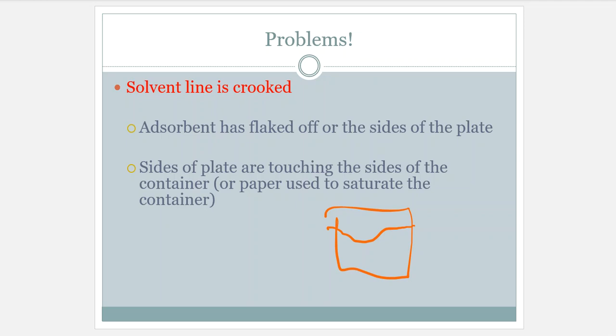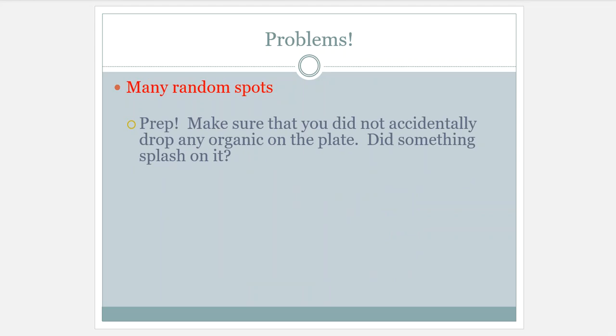So things are going to act in a different way, and you get a different line in the mobile phase areas of those things, because it is affecting the way samples are traveling through, but it's also affecting the way that the mobile phase is traveling through too. On the edges, if you see some curvature that happens there, that means the edges were probably damaged or touched or flaked in some form or in some phases. So that's kind of what happens and why those solvents go crooked sometimes at the very top.